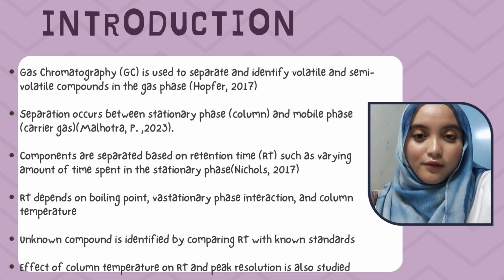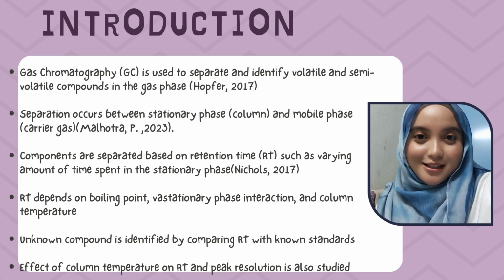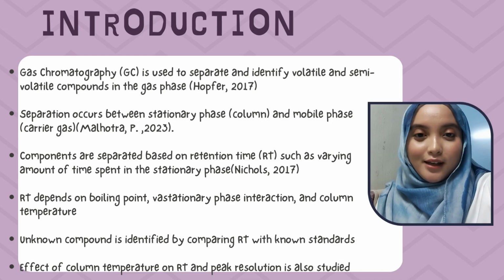So next, we have the introduction. Gas chromatography or GC is an analytical technique that we use to separate and identify volatile and semi-volatile compounds in a mixture. In GC, separation happens when the sample is carried by an inert gas through a column that contains a stationary phase.